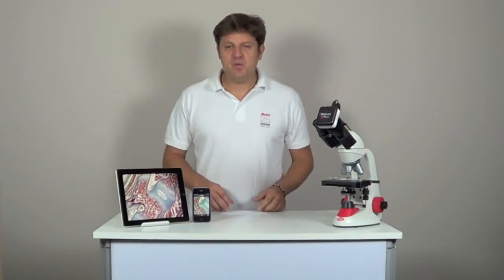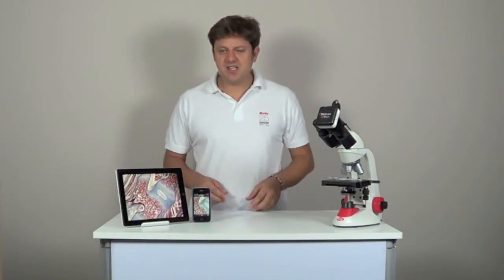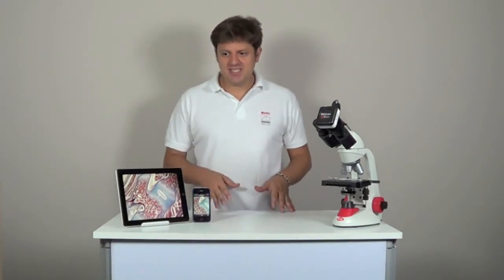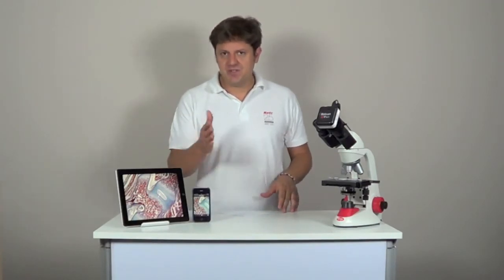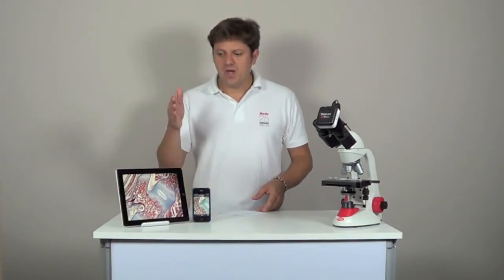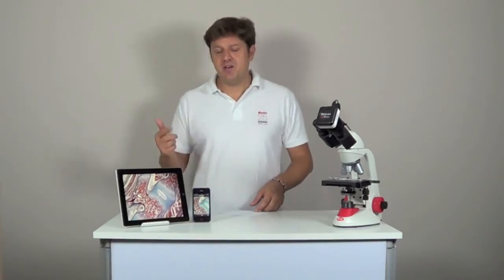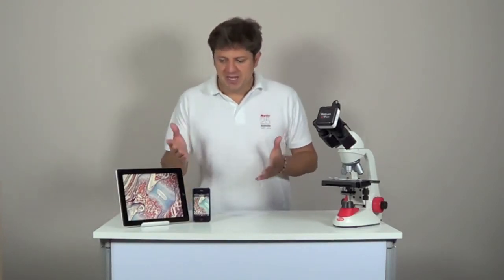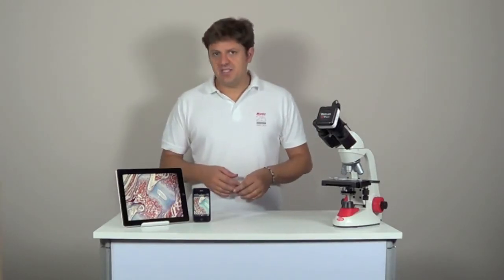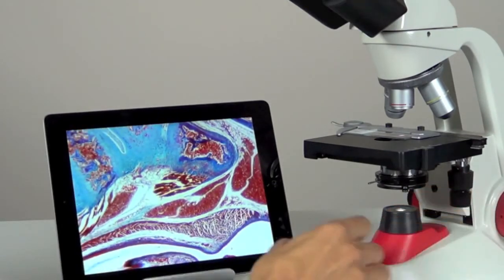Moticam X is a Wi-Fi camera with a resolution of 1.3 megapixels. It streams images with its own signal and up to 6 devices can be connected at the same time, be it tablets, smartphones or computers. When working with a computer you can use our software Motic Images Plus 2.0. When working with a tablet or smartphone you should download our free app MotiConnect from Google Play or App Store to capture, edit and share your microscope images. The Moticam X is a unique solution to turn your microscope into a Wi-Fi station.